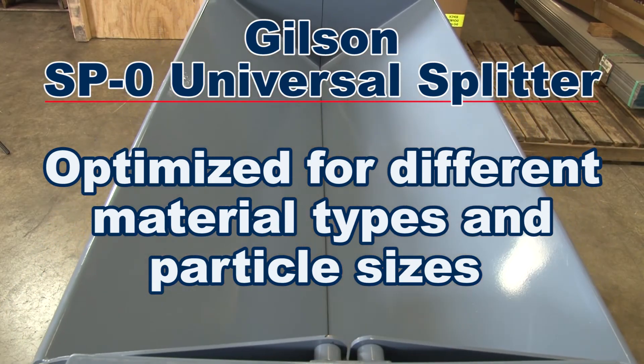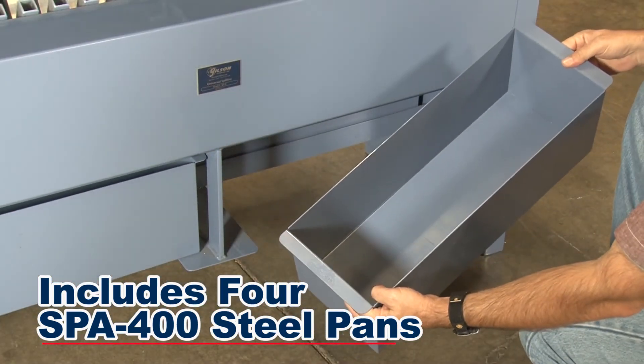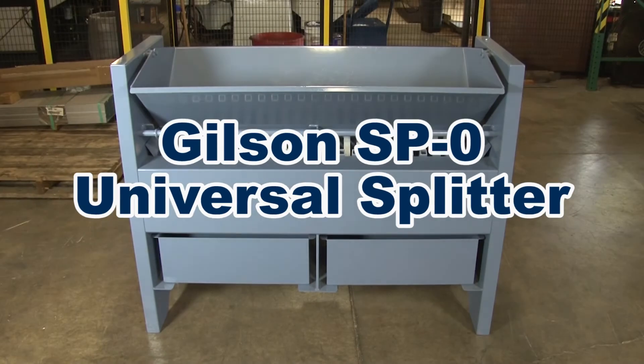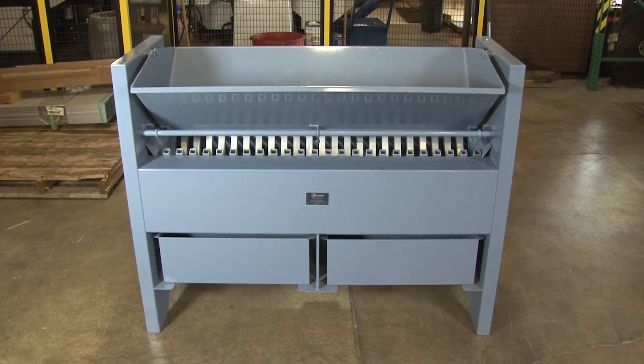The SP0 includes four SBA 400 one cubic feet capacity steel pans, and the optional SBA 450 lift cart assists with heavy loads, making the Gilson SP0 universal splitter the right choice for your materials testing lab.